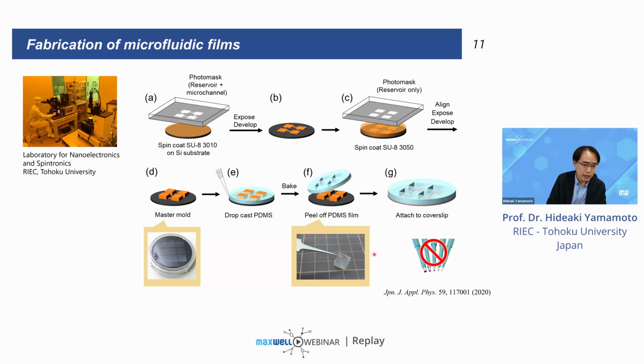One of the unique features of our microfluidic device is that we made this device thin so that the through holes where the cells enter the device are there when we peel off the PDMS from this mold, and there's no need to manually punch out the through holes using tools like biopsy punches.